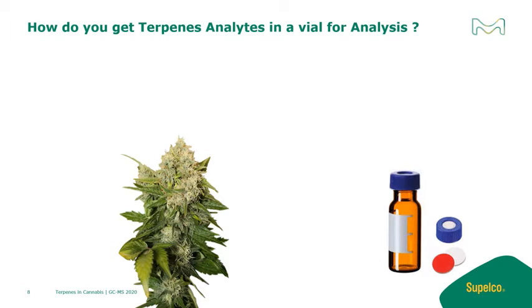There's SPME, or solid phase microextraction, which my colleague spoke about. There's solid liquid extraction. There's QuEChERS, which stands for quick, easy, cheap, effective, rugged, and safe. There are pros and cons to this technique when applied to cannabis flower. And there's SPE, or solid phase extraction. There's also dilute and shoot. However, that's not a viable option for this particular matrix.